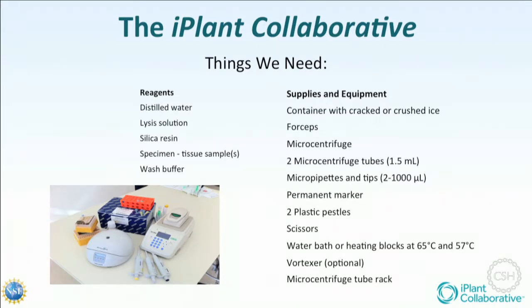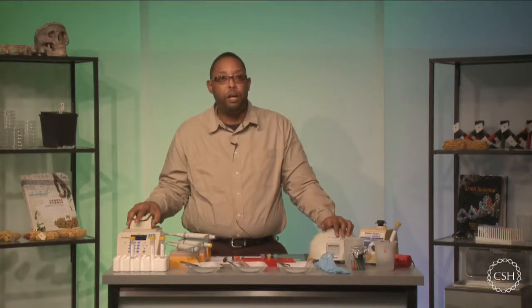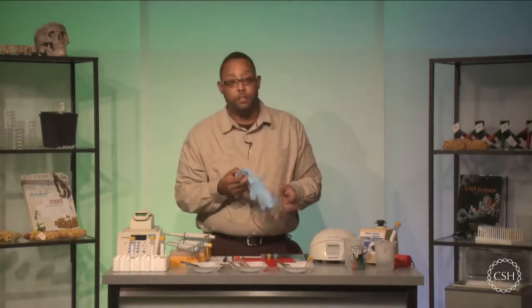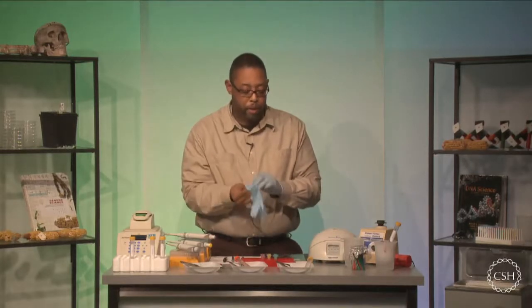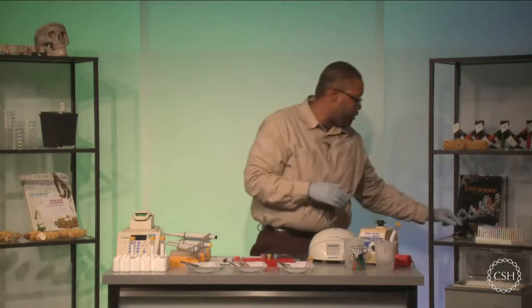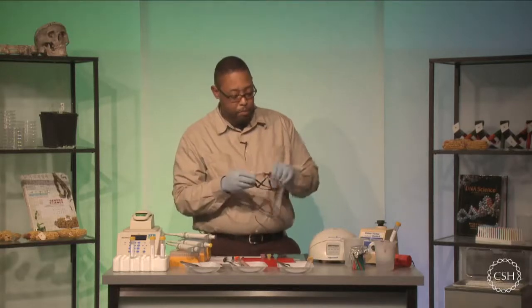Okay, so we're going to get started, and you can see that I have a lot of equipment physically here to do this DNA isolation. One thing I do want to promote is safety in the laboratory. I recommend that you wear gloves, so I'm going to put these on. You should also be wearing some type of protective eyewear, whether glasses or lab goggles. You need to make sure that you're wearing something protective over your eyes. I'm wearing my glasses, so I think I'll push on with that.